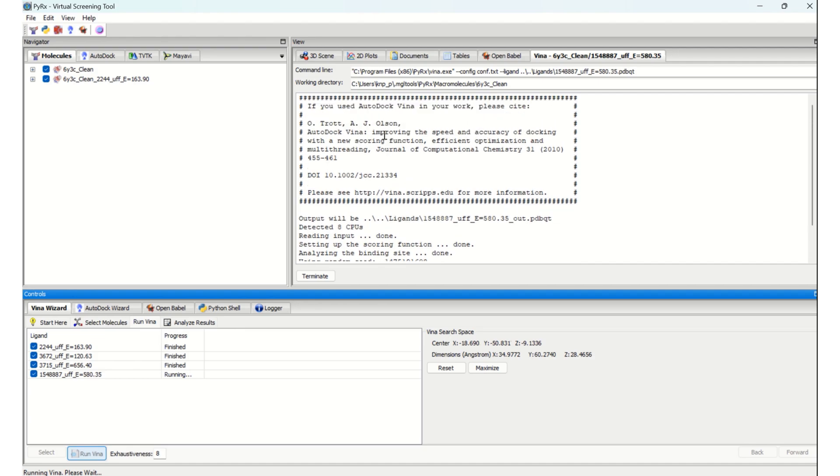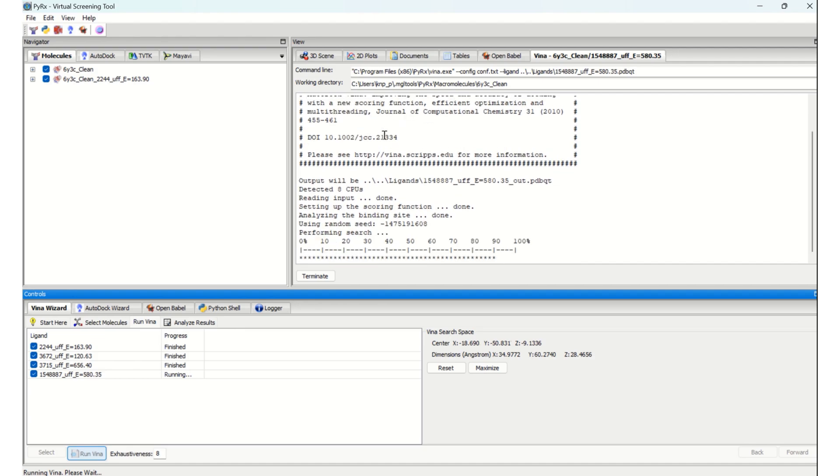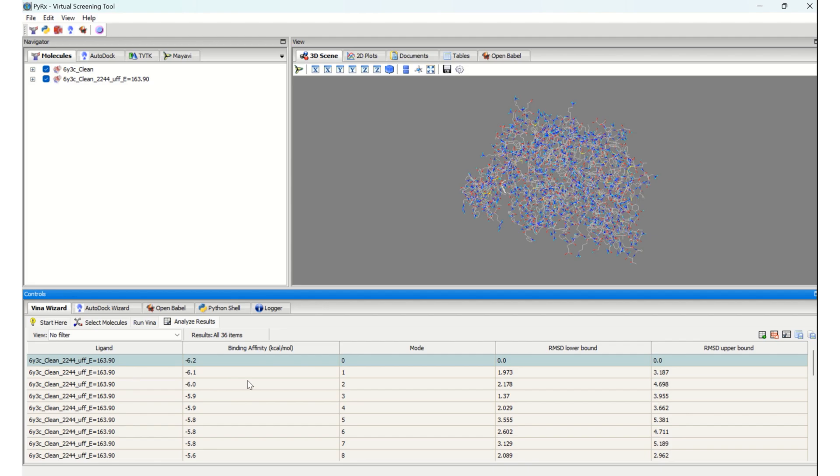Giving credit is very essential. Please do cite this particular article if you are using this. Now AutoDock Vina has completed its run, and you can see the binding affinities of the selected protein with ligands.